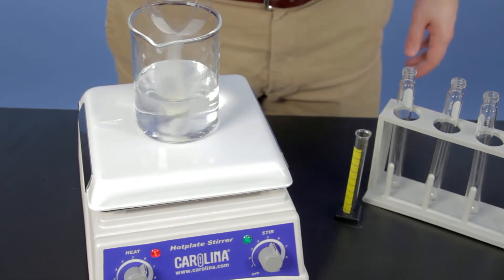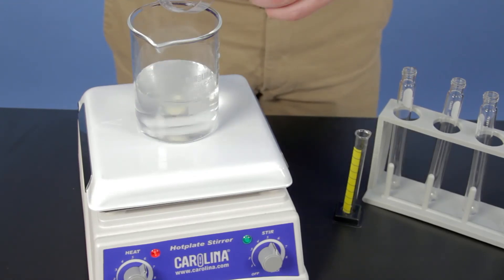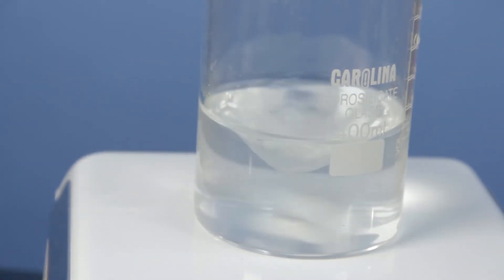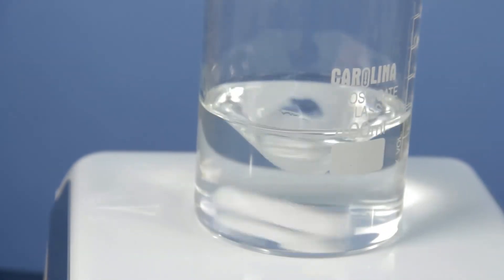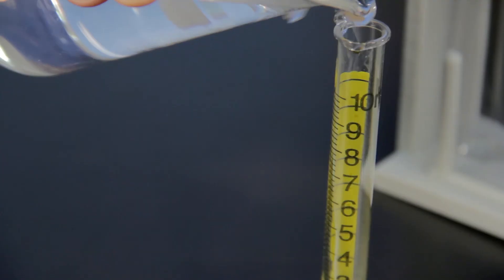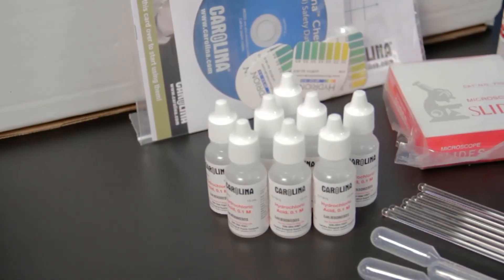The kit comes ready to use, so teacher preparation time is minimal, and all activities are designed to easily fit in a typical 50-minute class period. One thing to remember is that both the gelatin and the gum arabic solution need to be made in advance and chilled prior to the lab.